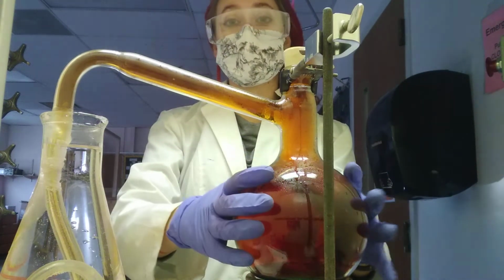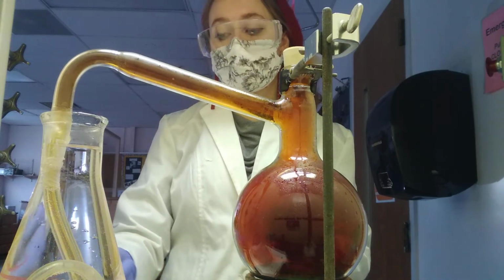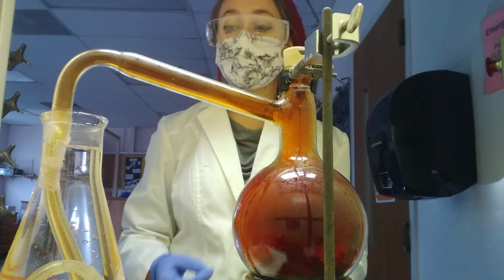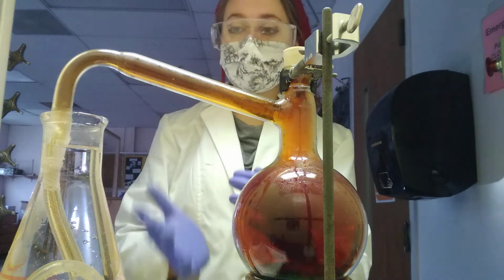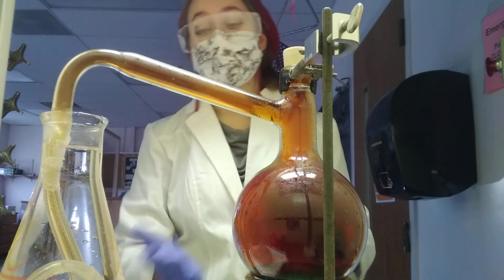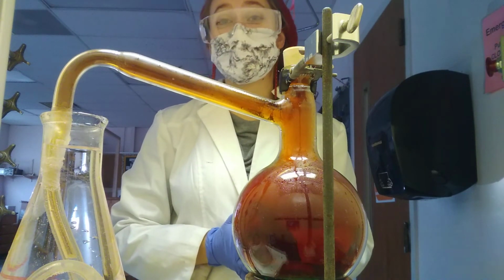But now that this flask is starting to cool just a little bit, we see that the NO2 is actually being pushed back up the tube by the water. Water is being pushed into the hose, and it's pushing the gas back into this flask. So we're going to see what happens when it pushes it all the way back into this flask. It might take a minute.